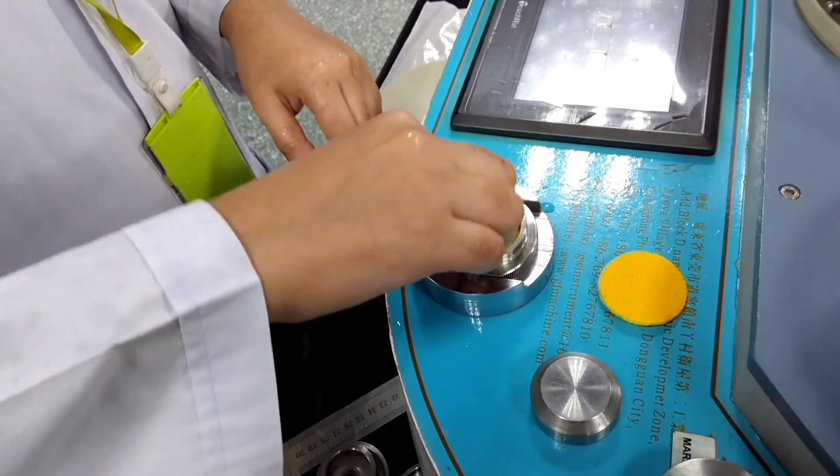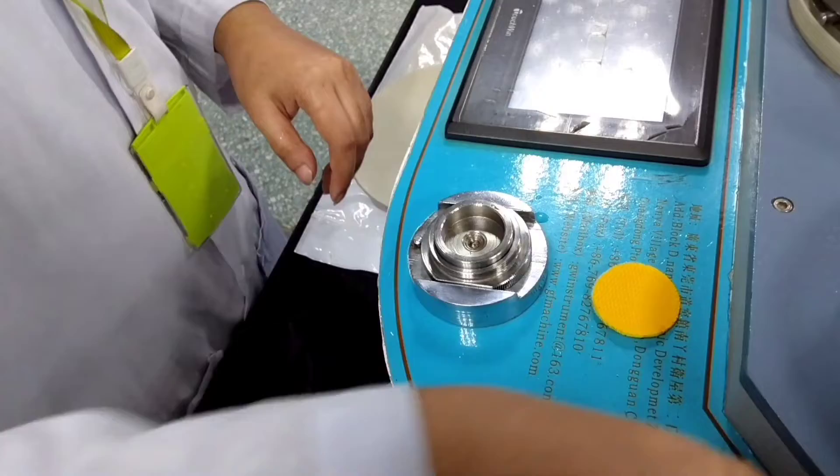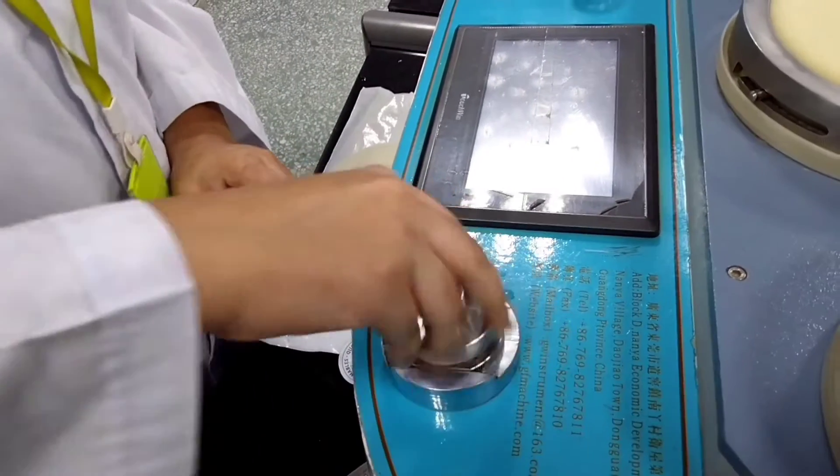Now, I set the specimen on the jaw for dry test. Now, I set the wet specimen.